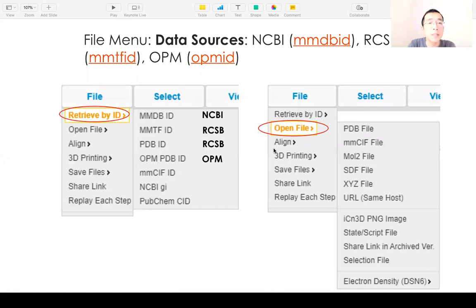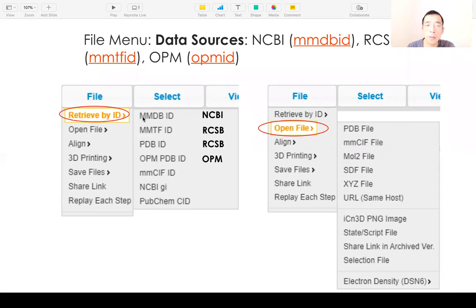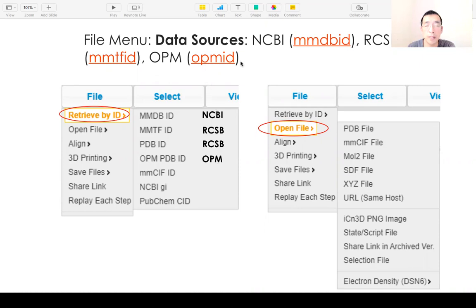iCn3D has a few menus. The first menu is the file menu. It shows different data sources. If you click 'Retrieve by ID', there is data from NCBI where you can define an MMDB ID, data from RCSB where you can use the MMTF ID or PDB ID, and data from OPM where you can use the OPM ID.